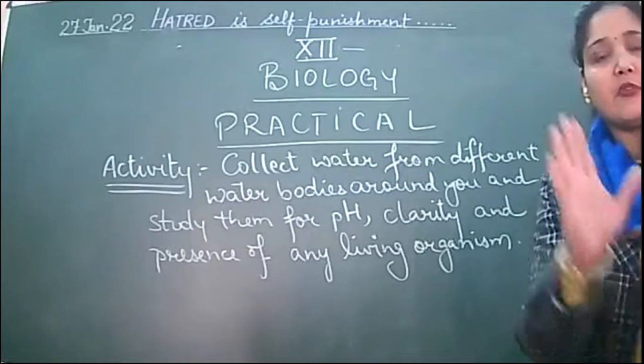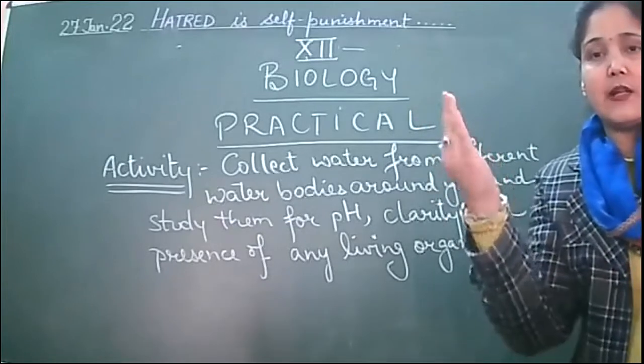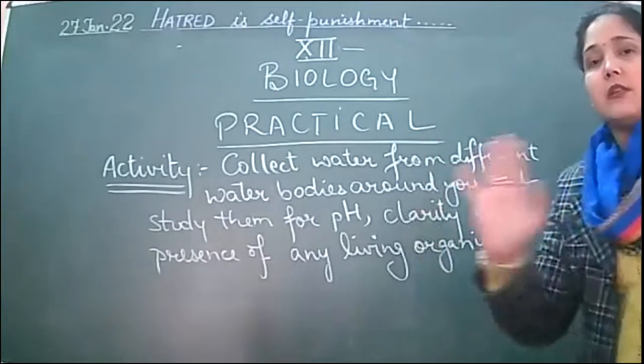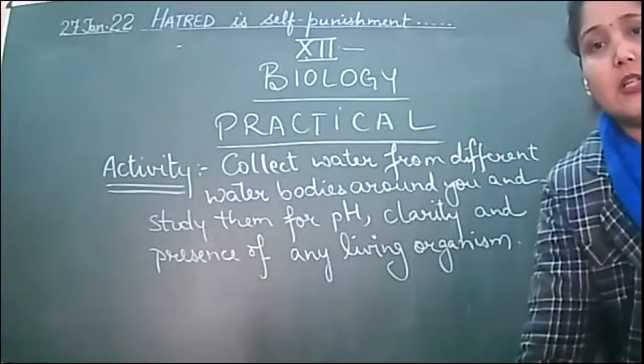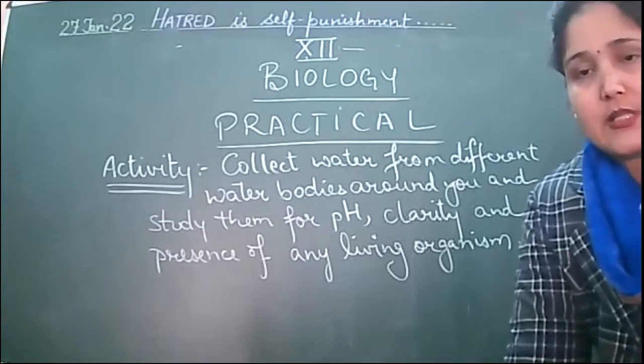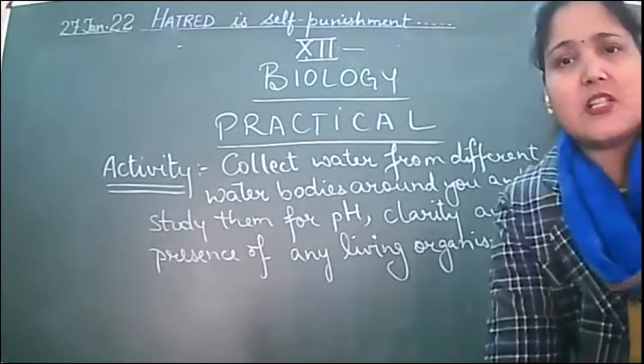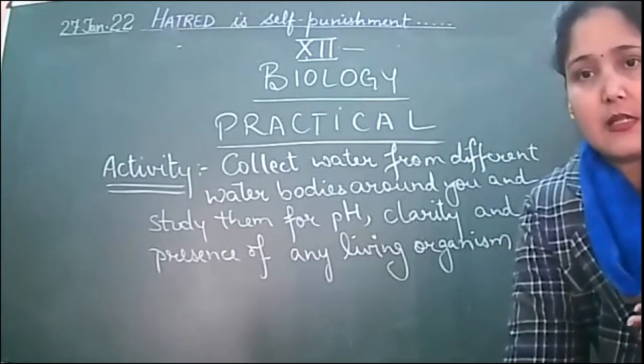But here, what do you have to do in performing? Simply you have to place it in front of the light, natural light or artificial light, and see whether the water sample was clear enough or it was having some turbidity inside it, like a whitish color appearance, okay?